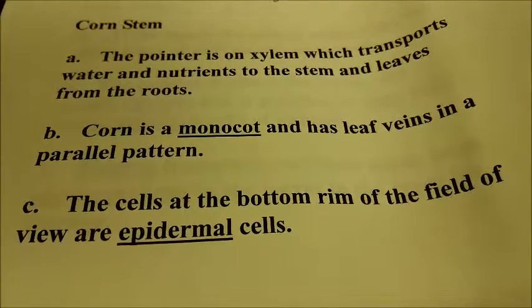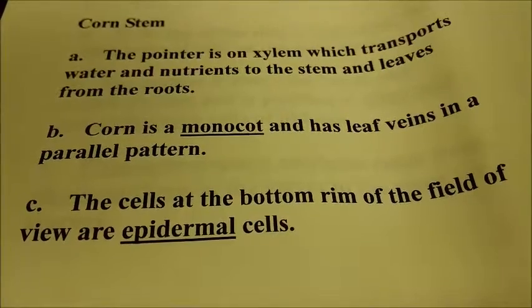The cells at the bottom rim of the field of view are epidermal cells.